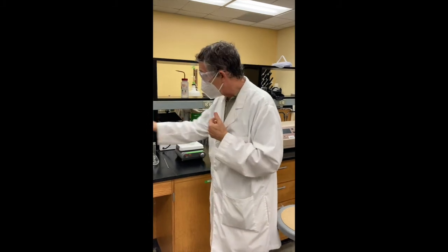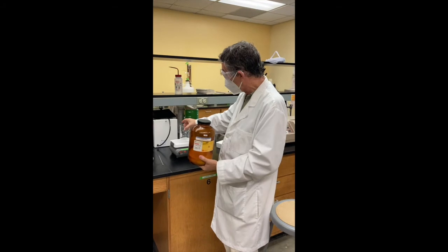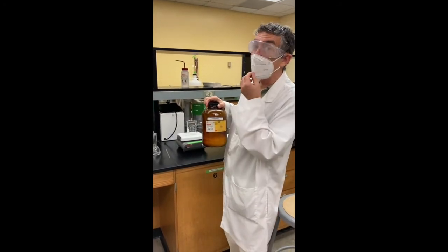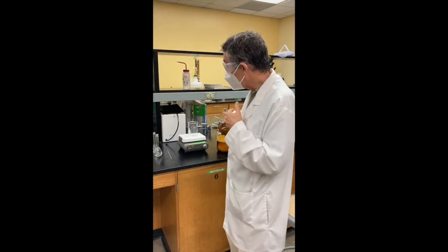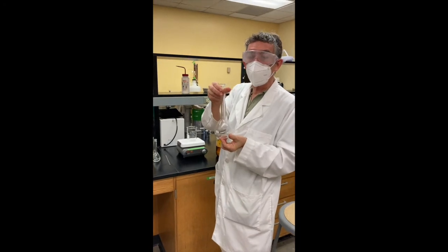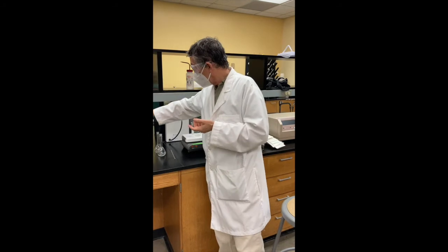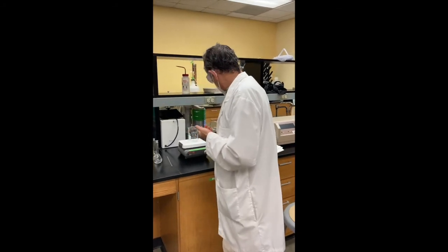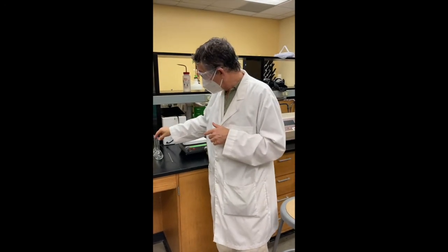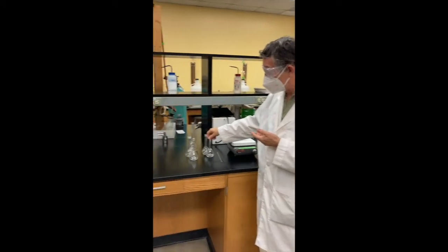So that's basically it. You'll use a hot plate, add a certain amount of this polyvinyl alcohol, and heat it up until it all dissolves, and that will take a long time. It often takes an hour. Then you'll have to dilute it. So you'll first make a solution in this 250 ml volumetric flask. You'll take some of that out to cleave with the potassium periodate, and then each of those solutions you'll dilute into these 100 ml flasks. And those will be the 4 samples you're going to analyze.